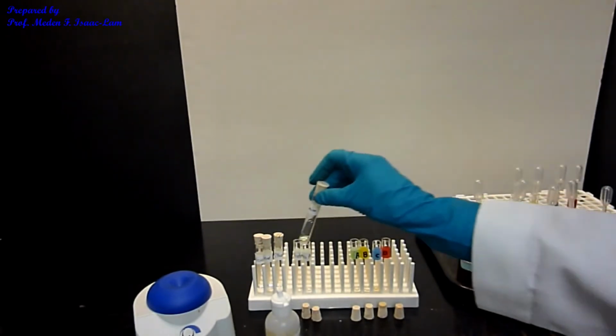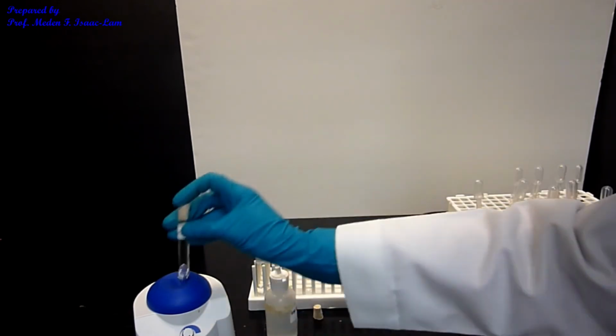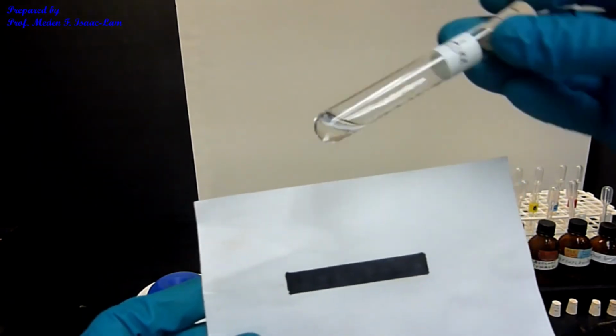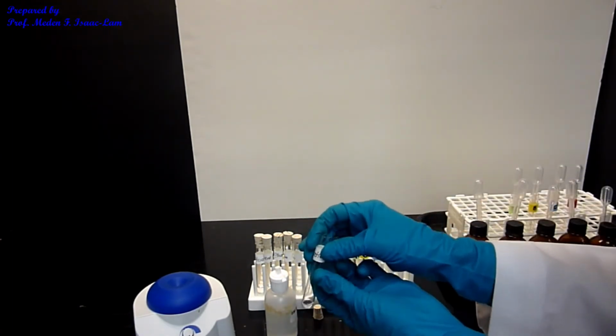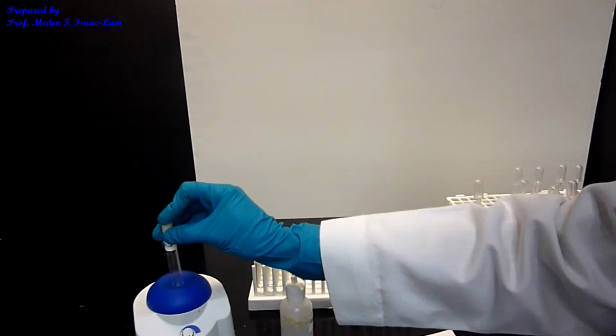Okay. And now we're gonna do acetone. So then mix it up. So you can see droplets on the side here. Okay. And now acetic acid and base, sodium hydroxide. It's miscible.